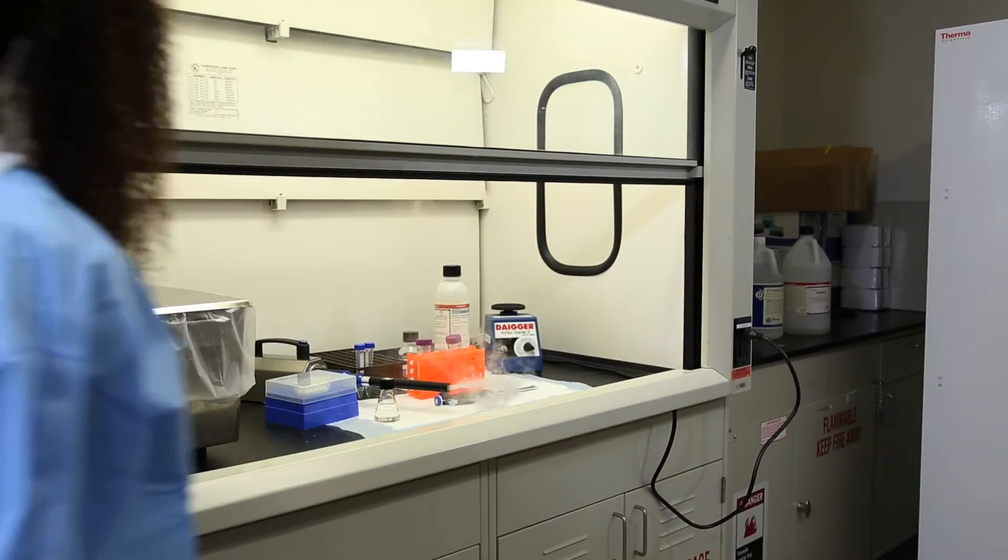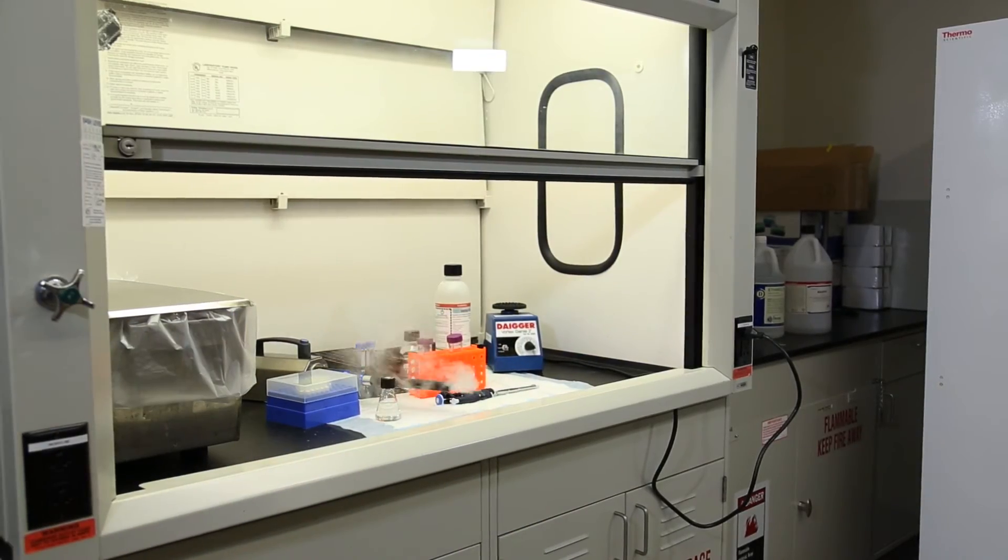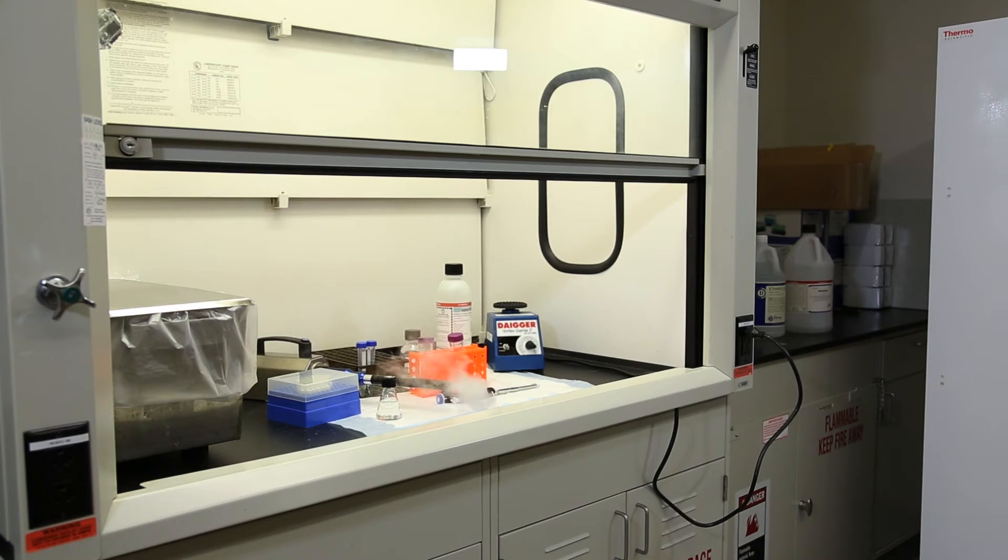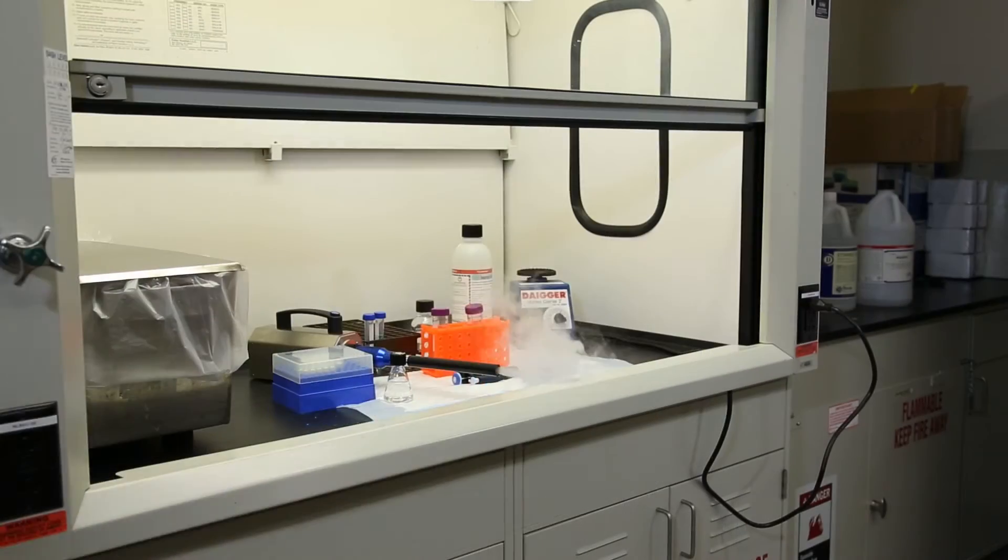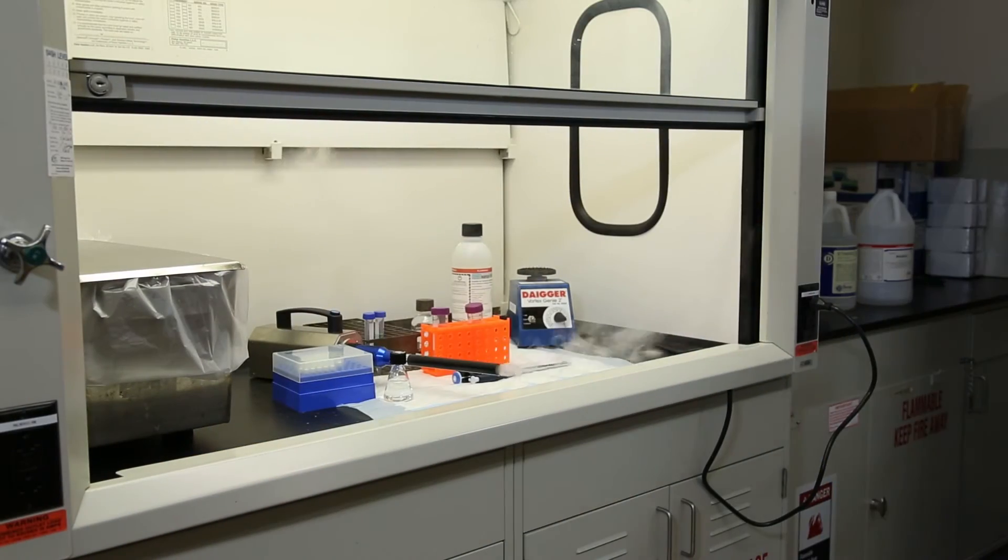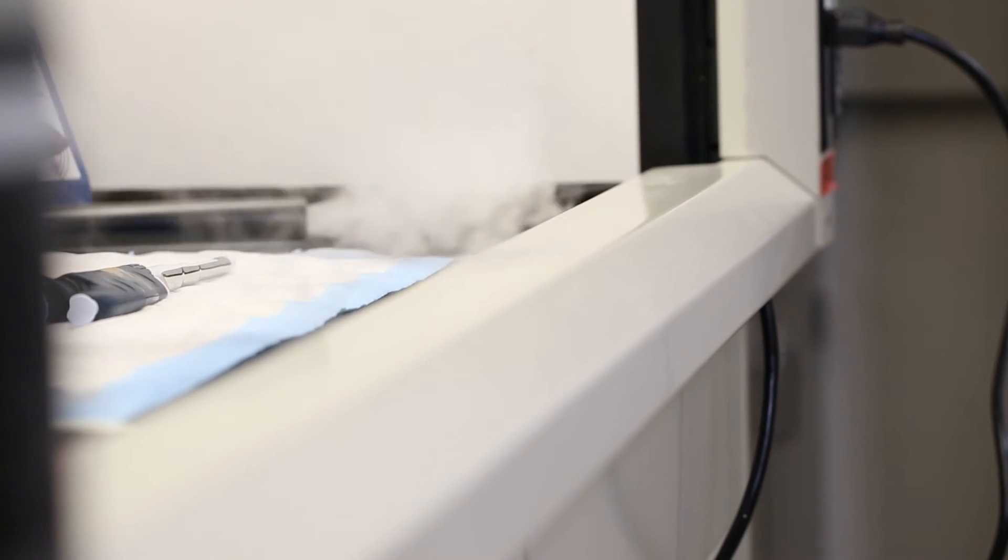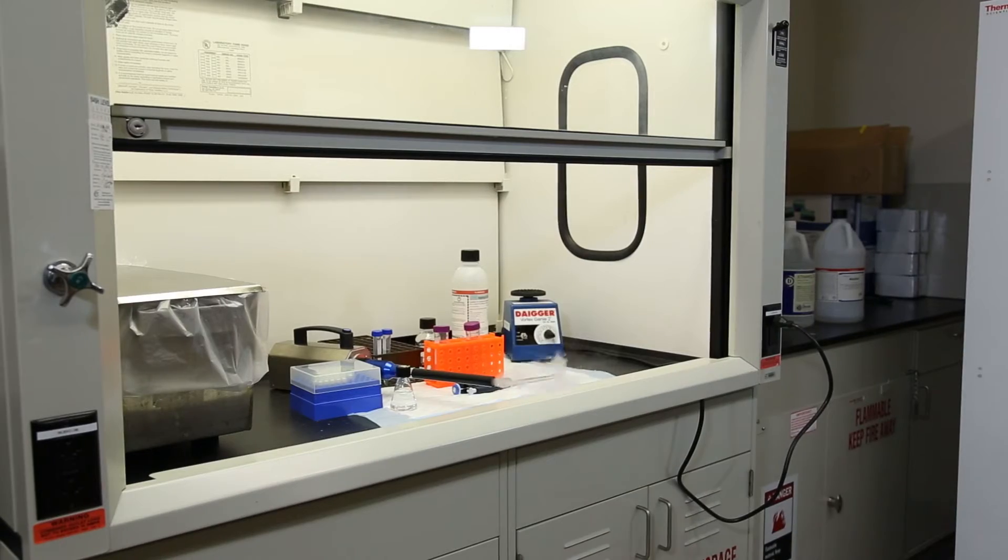Wakes or vortices form behind a person who is walking, and the velocities in these vortices exceed 250 feet per minute. When a person walks in front of an open fume hood, the vortices can overcome the fume hood face velocity and pull contaminants out of the fume hood, into the vortex, and into the laboratory.